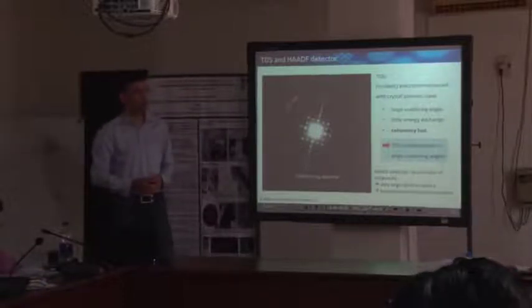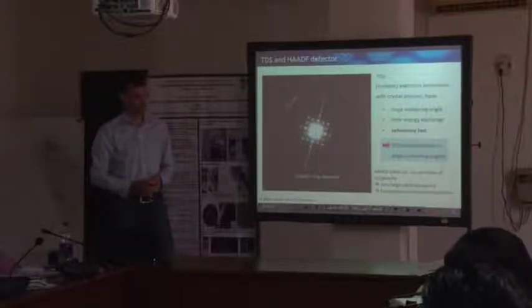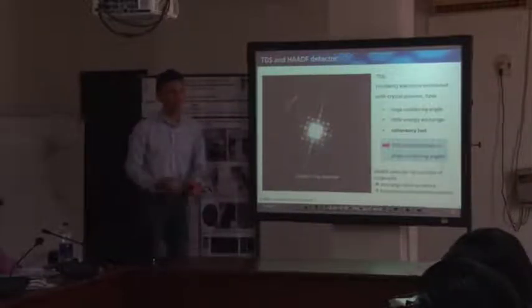But for anything, whether normal bright field or annular bright field, the necessary condition is that the zero disk should go into the detector. The direct beam hits the detector. This is called bright field.